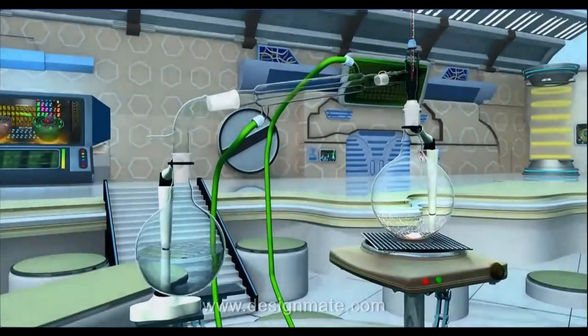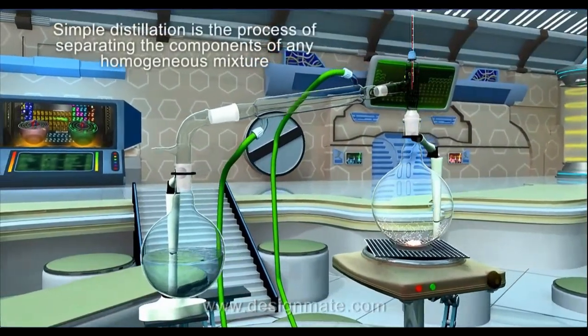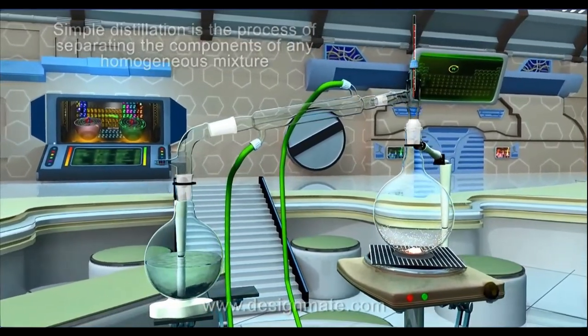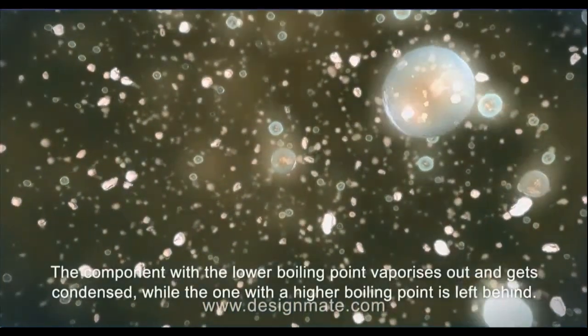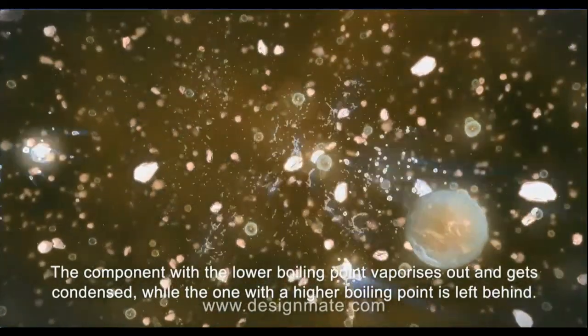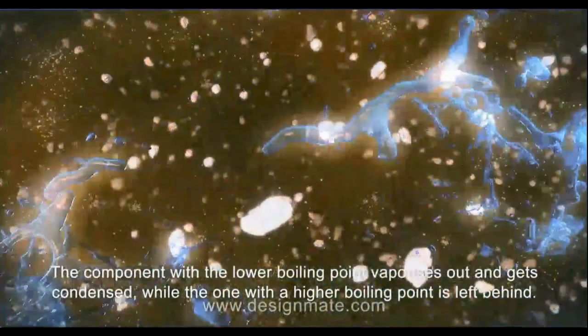In general, simple distillation is the process of separating the components of any homogeneous mixture, such as seawater. The component with the lower boiling point vaporizes out and gets condensed, while the one with a higher boiling point is left behind.